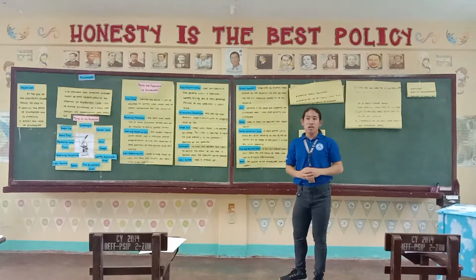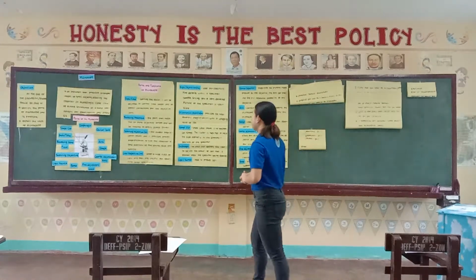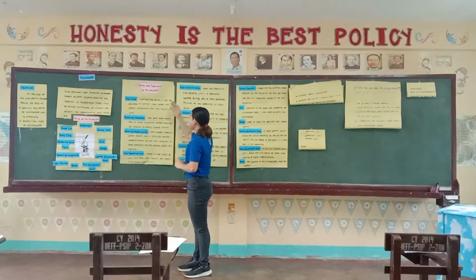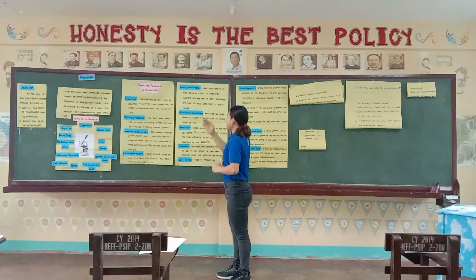Since you already know the different parts of the microscope, let's talk about their corresponding functions. So, class, the parts and functions of a microscope. Domingo, can you please read what a draw tube is? Okay, thank you. A draw tube carries the ocular. It can be adjusted to control tube length and so effect corrections for the objective lens.